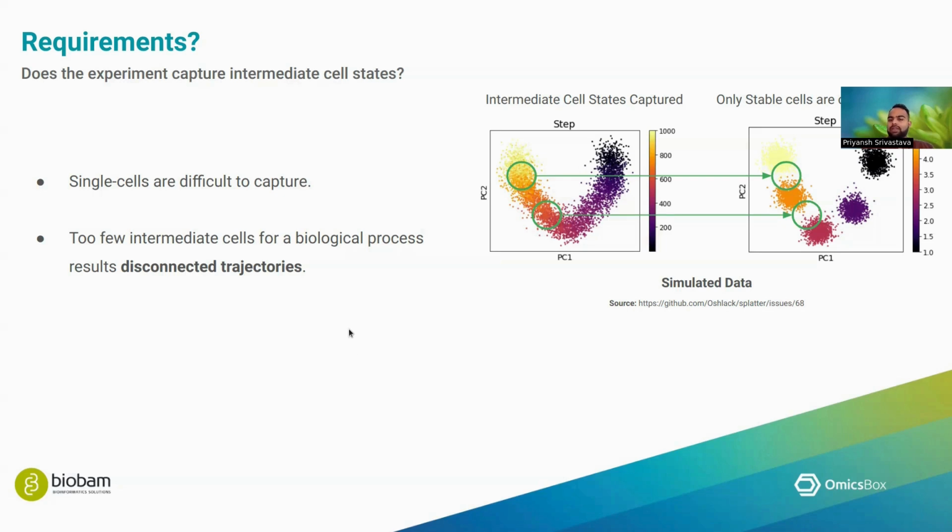So unless you are putting some very stringent filters, they will end up in your data set, and then you might not be able to provide them cell type labels confidently. So these represent the intermediate cell states. They are not fully functional, or cannot be assigned to a cell type with confidence, but they still are expressing some kind of markers which are related to some specialized cells.